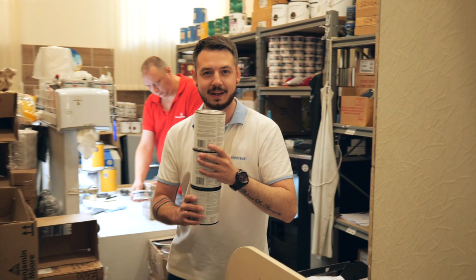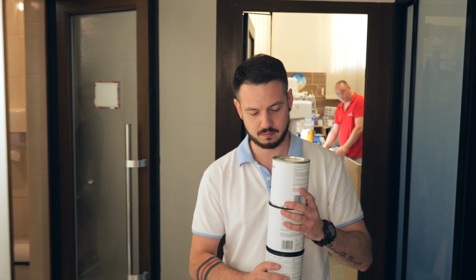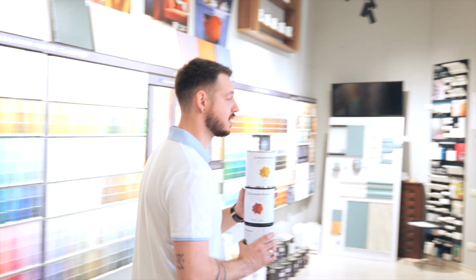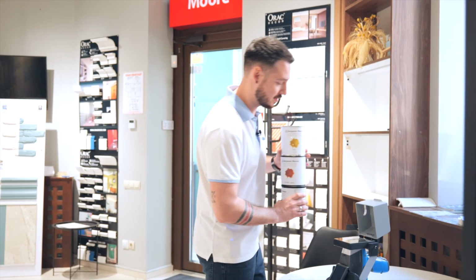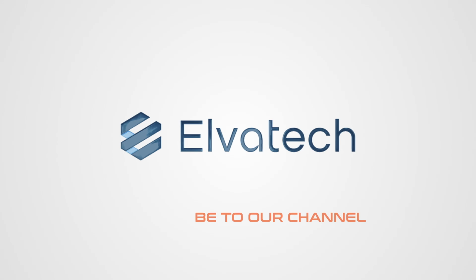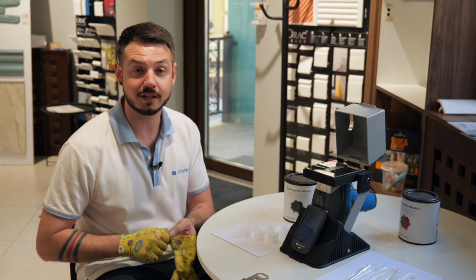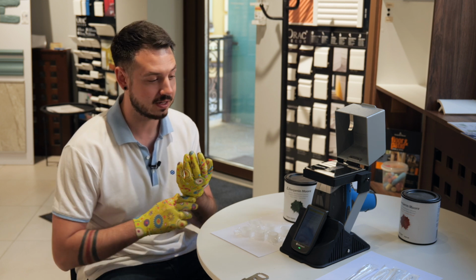So let's perform the analysis. All three samples we will pour into special sample cups, and we will perform the liquid analysis. Here we have a special set that is going to be very useful for any kind of liquid analysis.